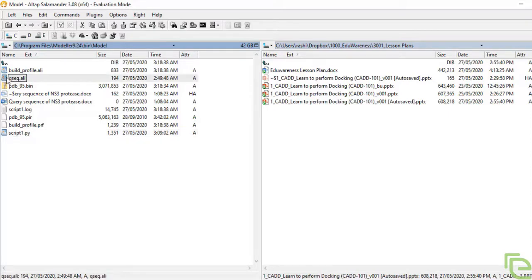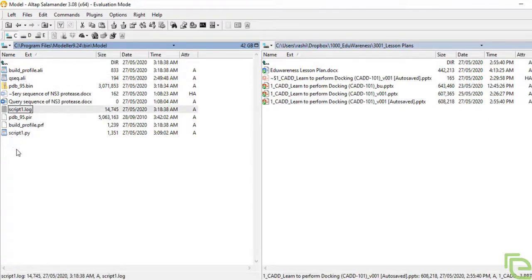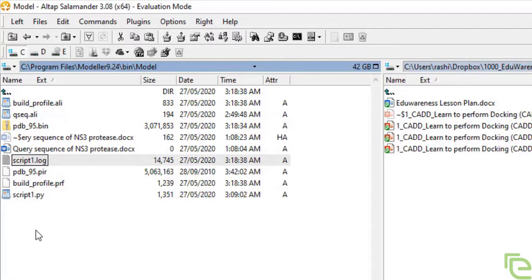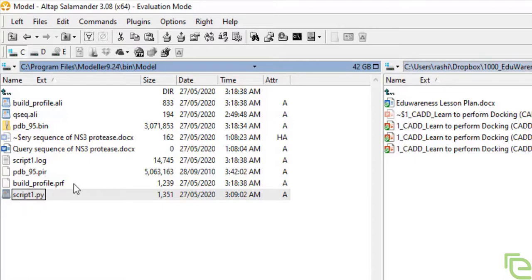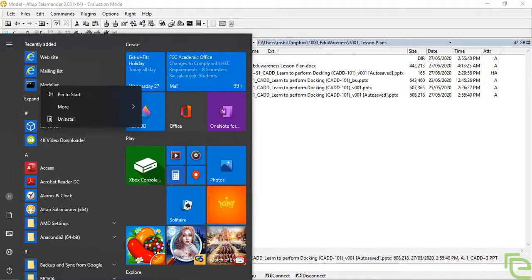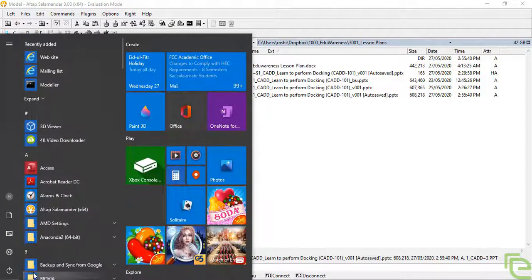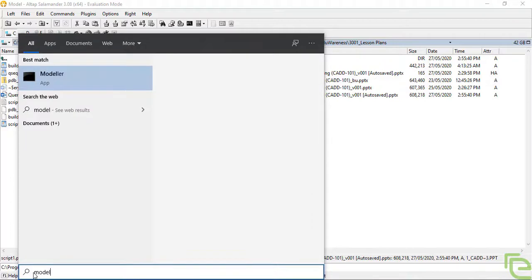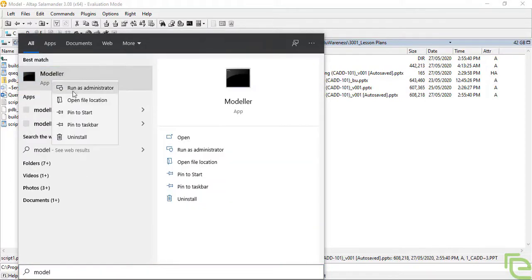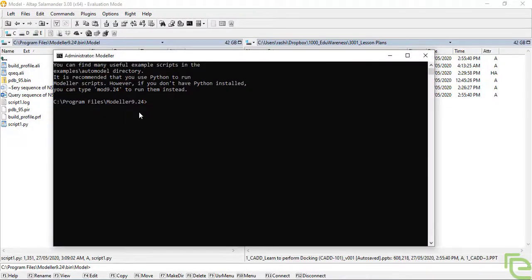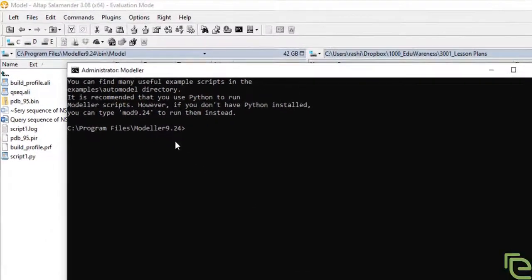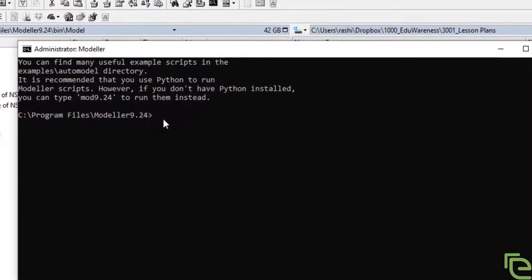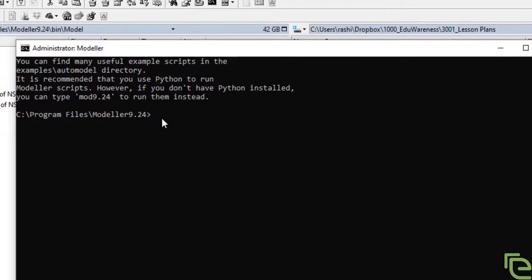We prepared our query sequence file, and with the help of script 1, we got the file script 1 dot log as the result of running the script. We used modeler from command prompt. You should run it as administrator because the file will be written in C drive and you need to have administrative privileges to write any file in C drive. We went to CD bin and then model, and we have these files.